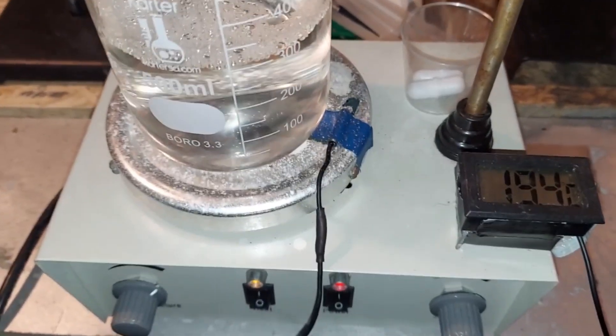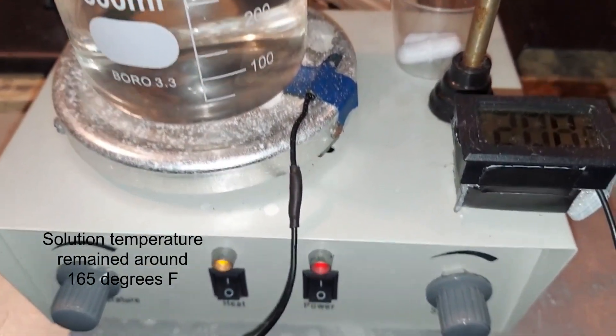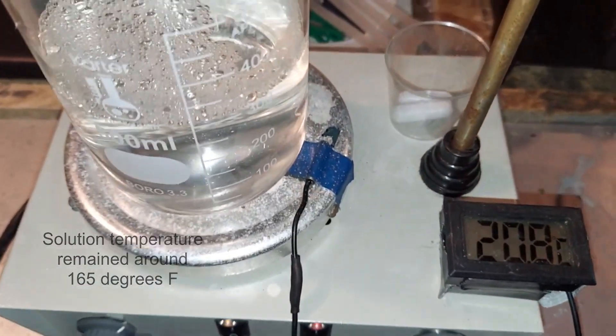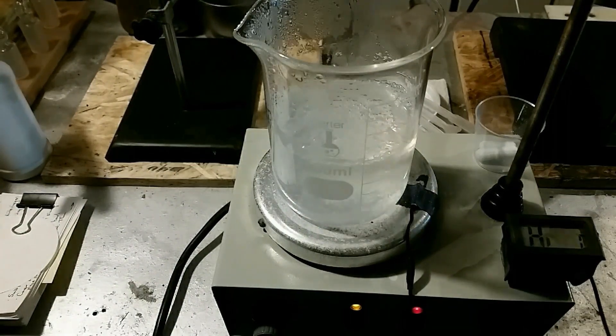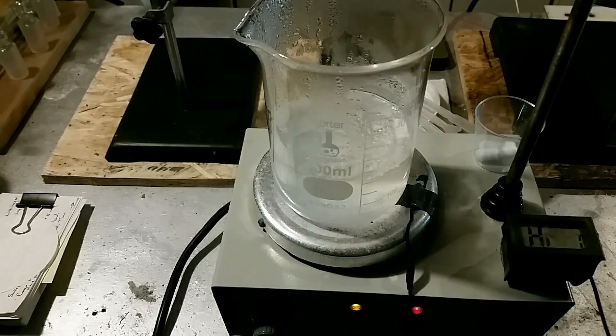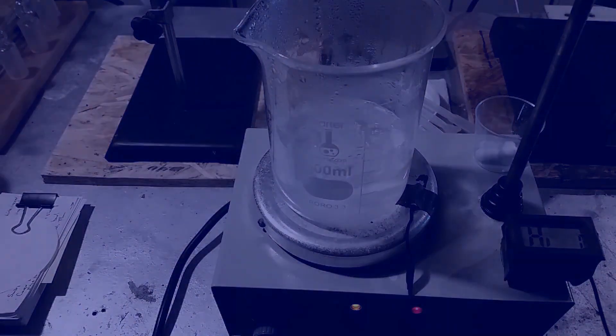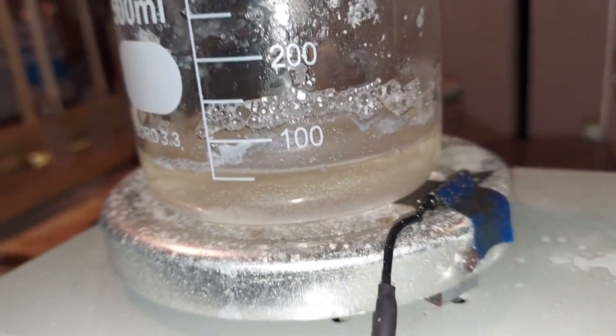I'm starting to heat the calcium acetate solution here. I don't think any stirring is necessary, but remember this is gentle heating — do not overheat it or you'll form acetone. We're down to about a quarter of what we started, so I'll turn it off and let it cool down.